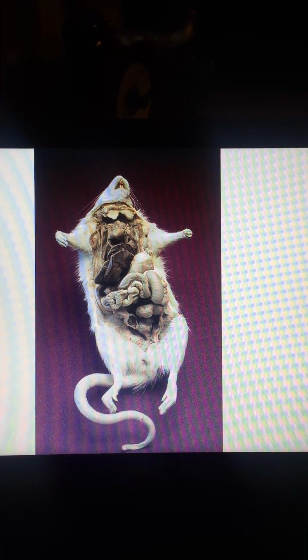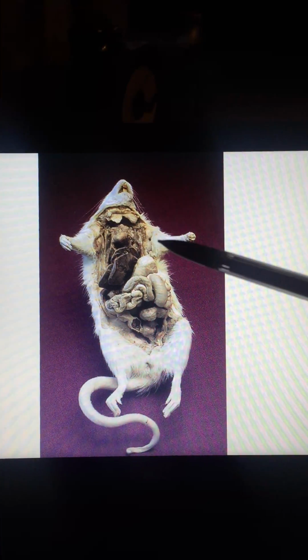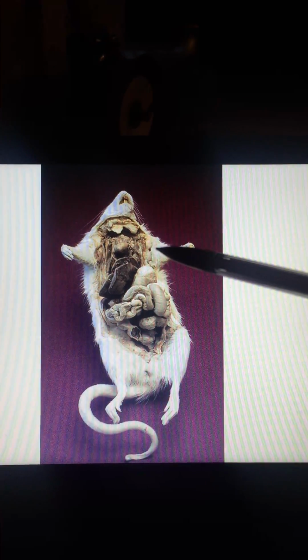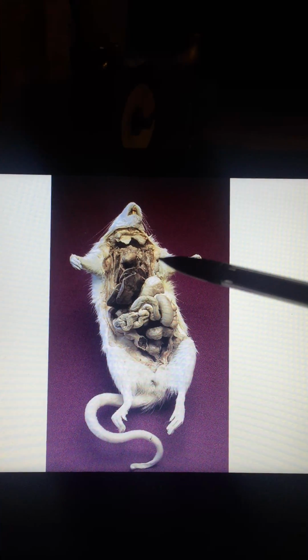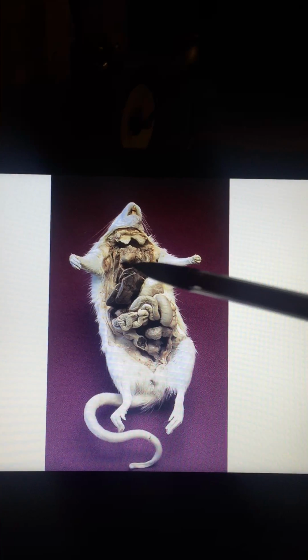So right there, we've just covered a good amount of structures. They're in your chest, and they're also in the chest of the rat. And chest is referring to this area from the head to the arms, right in between the arms or armpits of the rat. And again, that was the heart, the lungs, the ribs, and the diaphragm, which is directly below the lungs and heart.